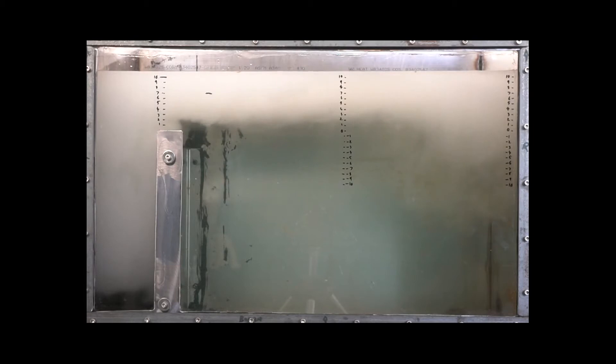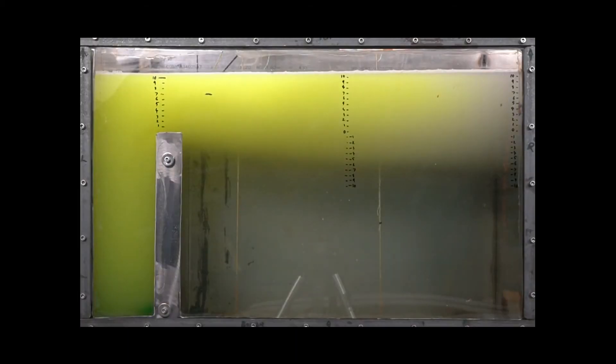The dirty water coming into the DAF tank mixes with these bubbles. The bubbles attach to the particles and remove them to the top of the tank. These particles can then be removed by skimming the surface, and the clean water leaves the tank from the bottom right.